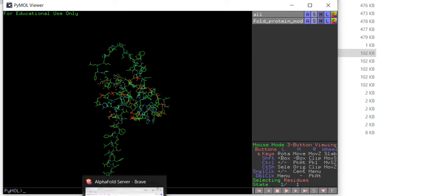But before leaving, please let us tell you that you can also use AlphaFold3 to model multimeric proteins. What are multimeric proteins? Multimeric proteins are those proteins which have 2, 3, 4 or multiple protein chains. If you want to model multiple proteins, then you have to select the protein twice, thrice, or 4 times, and then paste its sequences in AlphaFold3. AlphaFold3 with very high reliability predicts the multimeric three-dimensional structure of the protein for you.